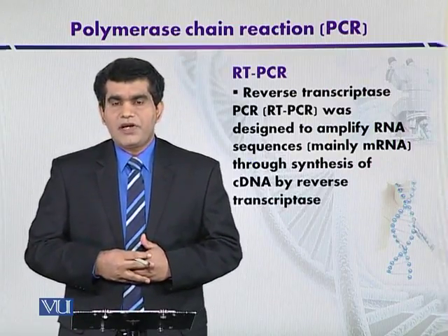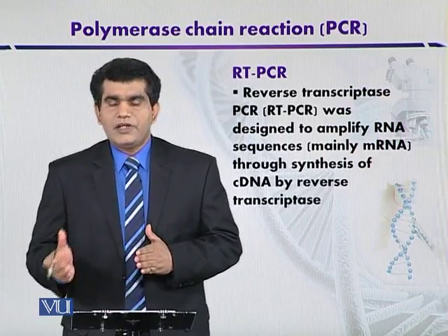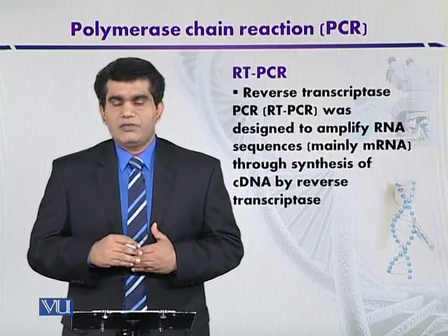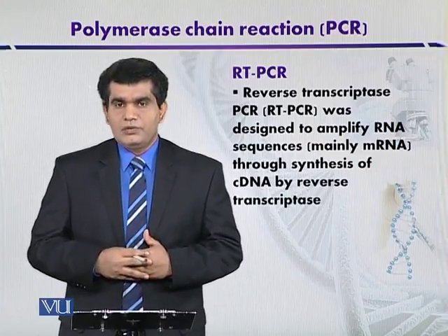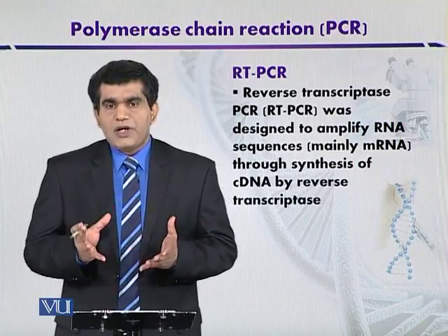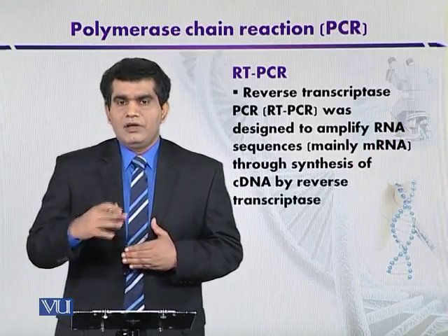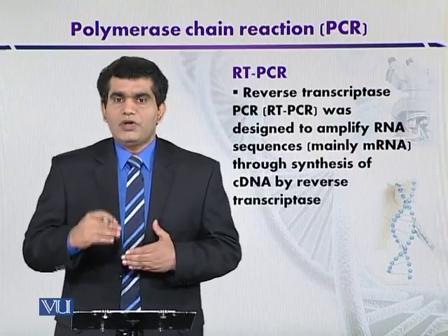RT-PCR is a very effective technique not only to convert RNA into cDNA molecules, but it can also be used in the quantification of RNA by using competitor RNA molecules. And here the same primer is used for competitor and target RNA molecules in case we are going to quantify this molecule.